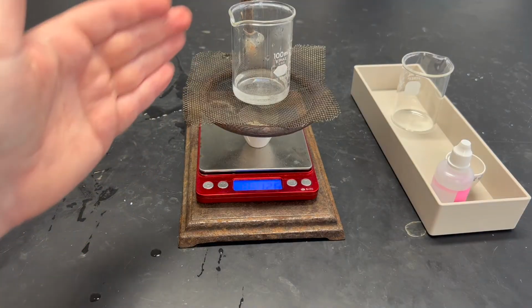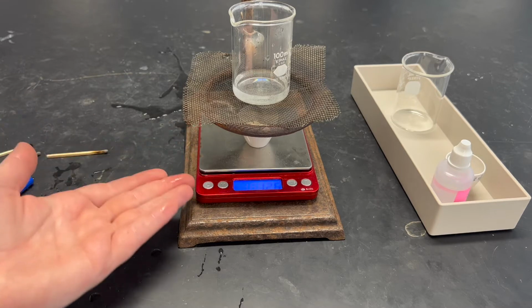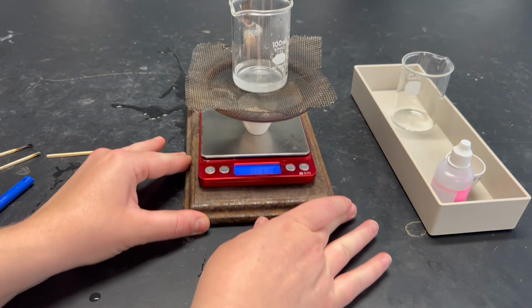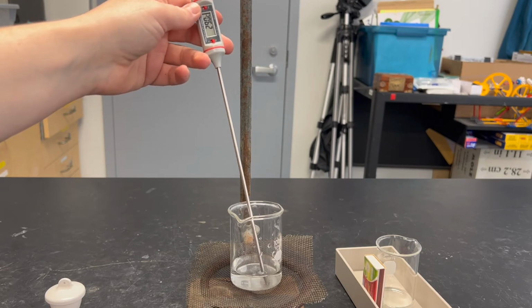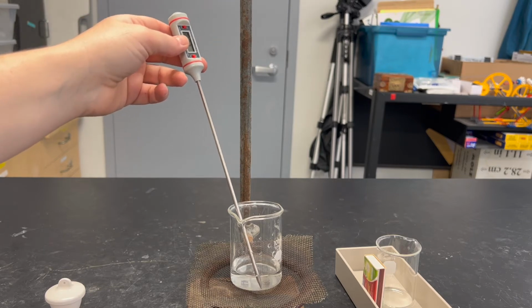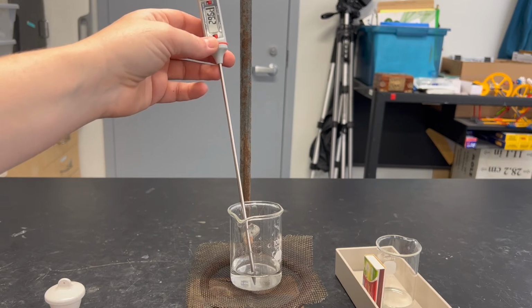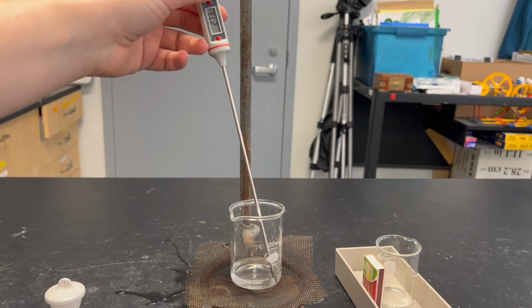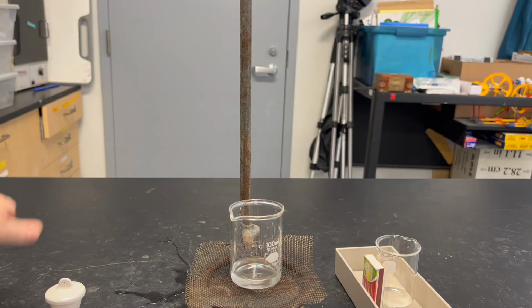Now that my ring stand is adjusted so it's directly over my crucible and everything's ready to go, I can now take an initial temperature of my water. Put your thermometer into your beaker, take the initial temperature, and someone needs to hold the thermometer because it's not going to balance in the beaker. You're going to watch the temperature as it rises, and you're looking for a max temperature. Now that I've gotten an initial temperature, someone else is going to hold this, your partner. I'm going to put mine down.